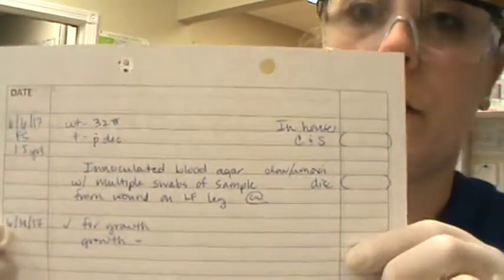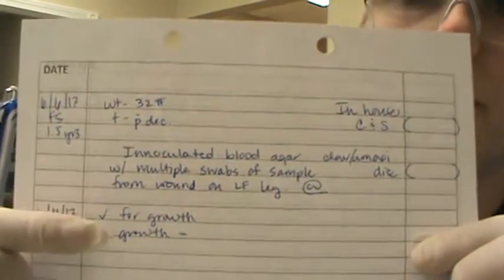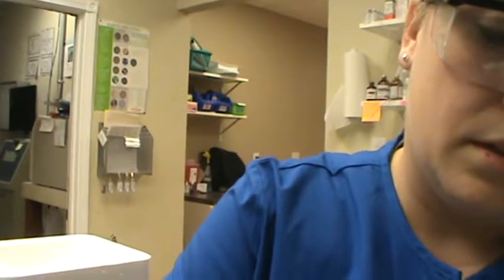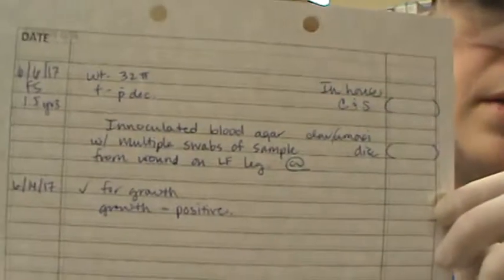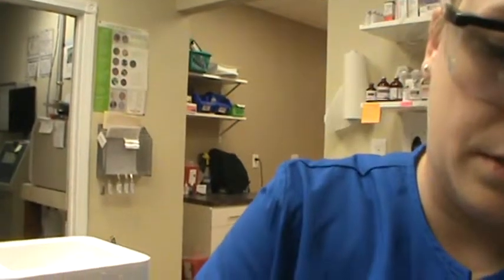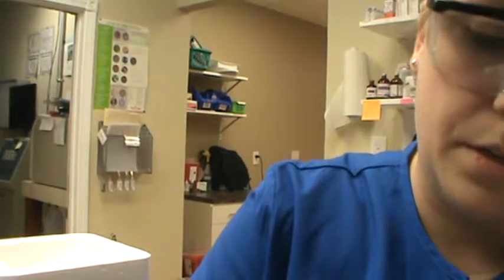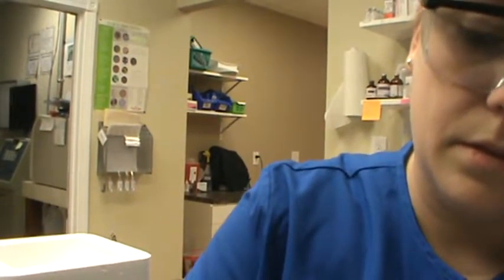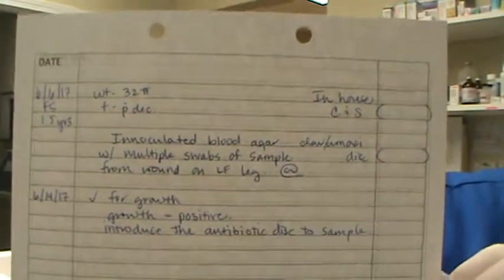So we have our patient chart stating the date we started the culture and sensitivity, and then our recheck today. Growth, I'm going to say probably positive. Okay, so recorded as positive, and that we are introducing the antibiotic disc to the sample. Okay, so we have that there, nicely charted for patient Roxy, and we will revisit this as soon as it is done incubating.